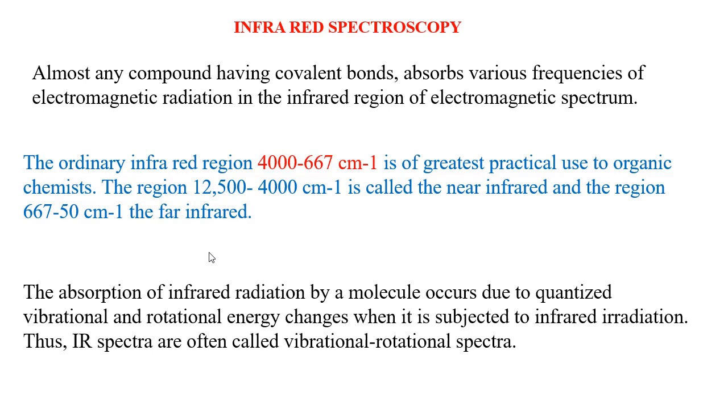Okay, you know, the absorption of infrared radiation by molecules occurs due to quantized vibrational and rotational energy changes when it is subjected to infrared radiation.